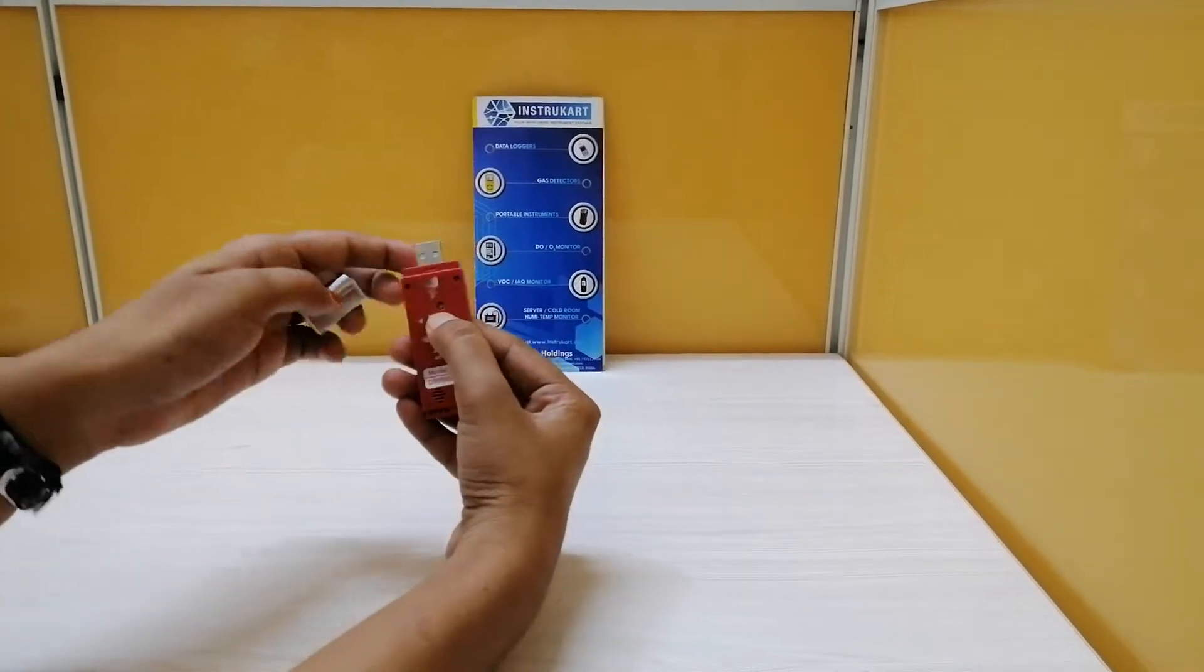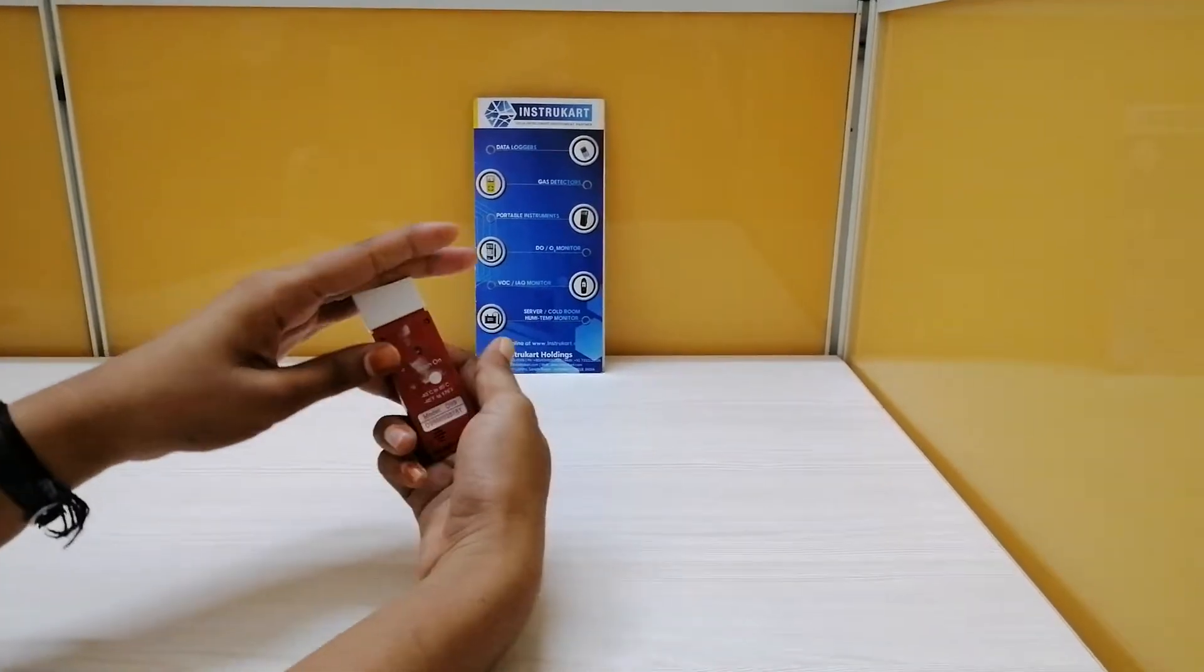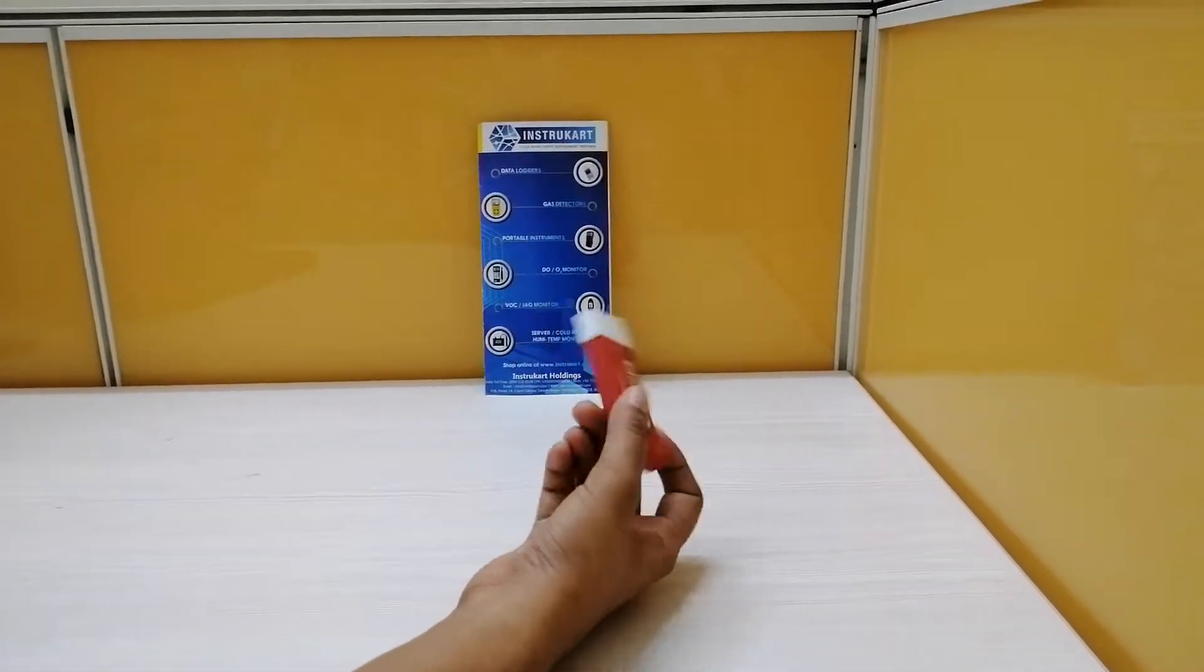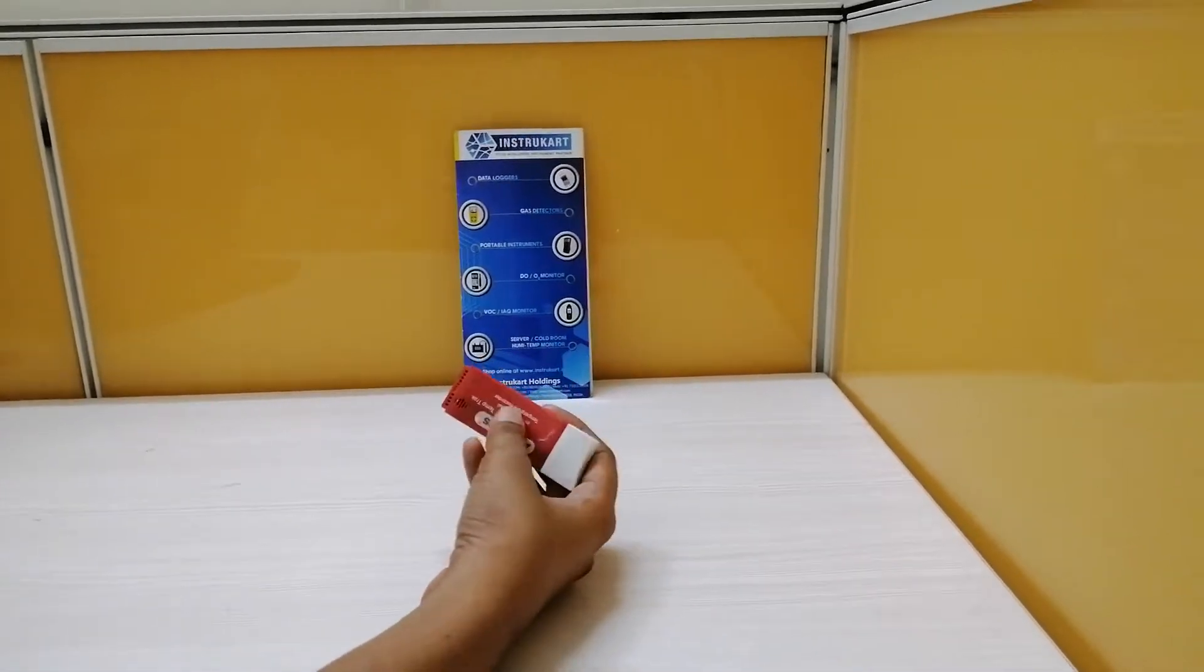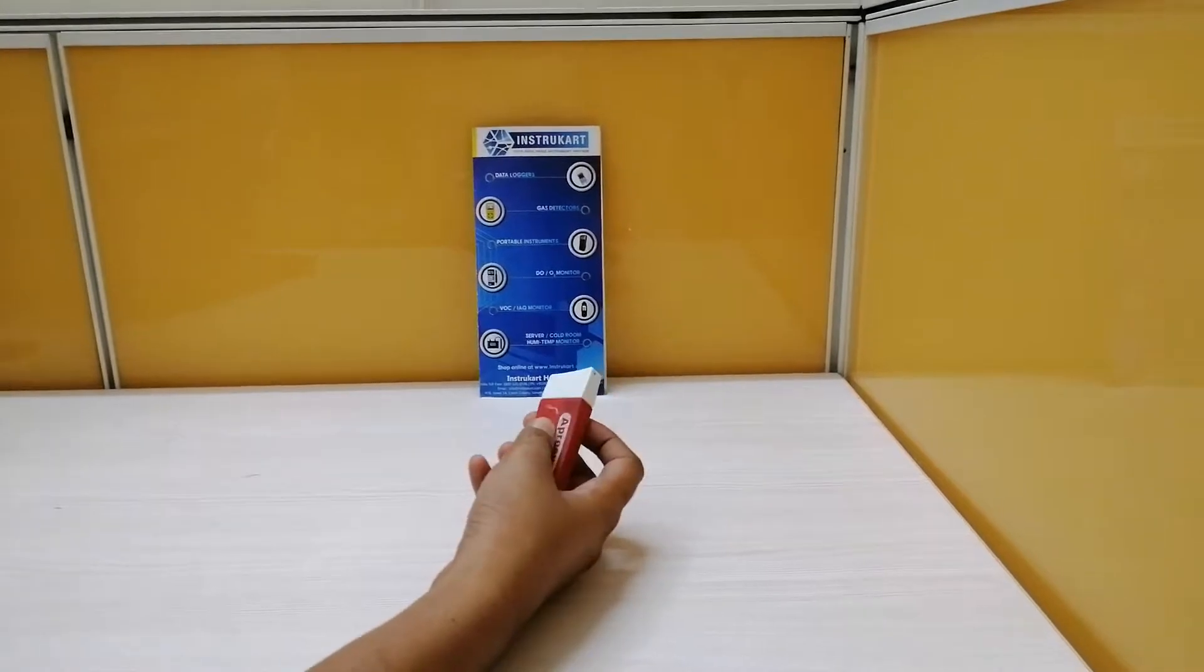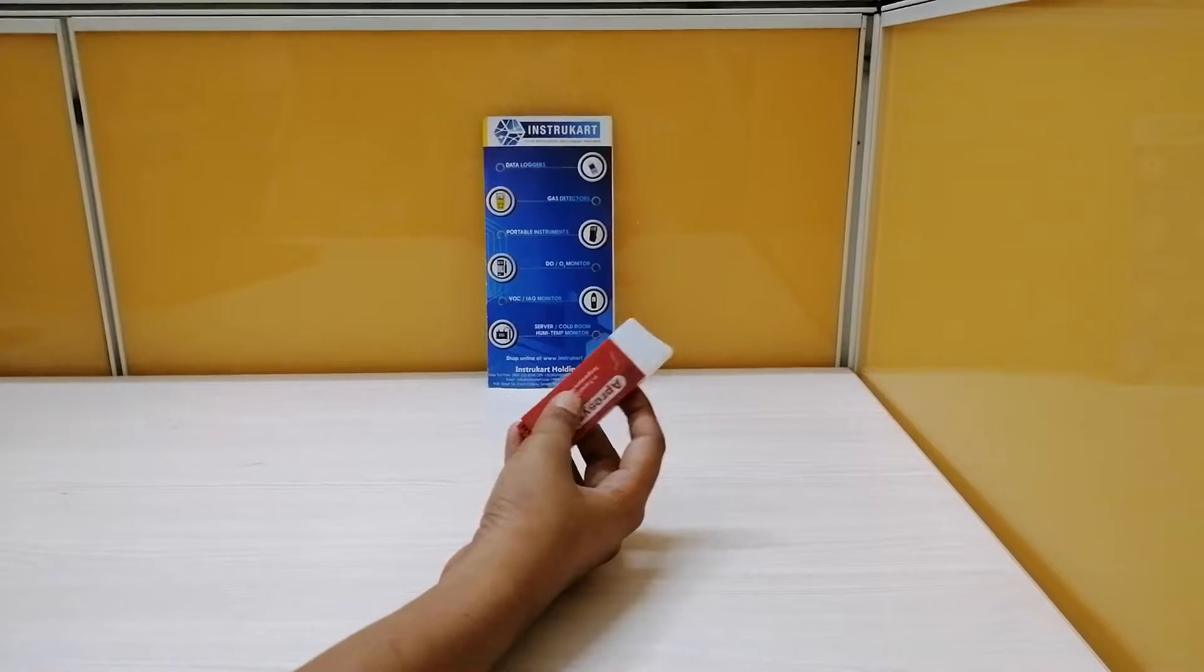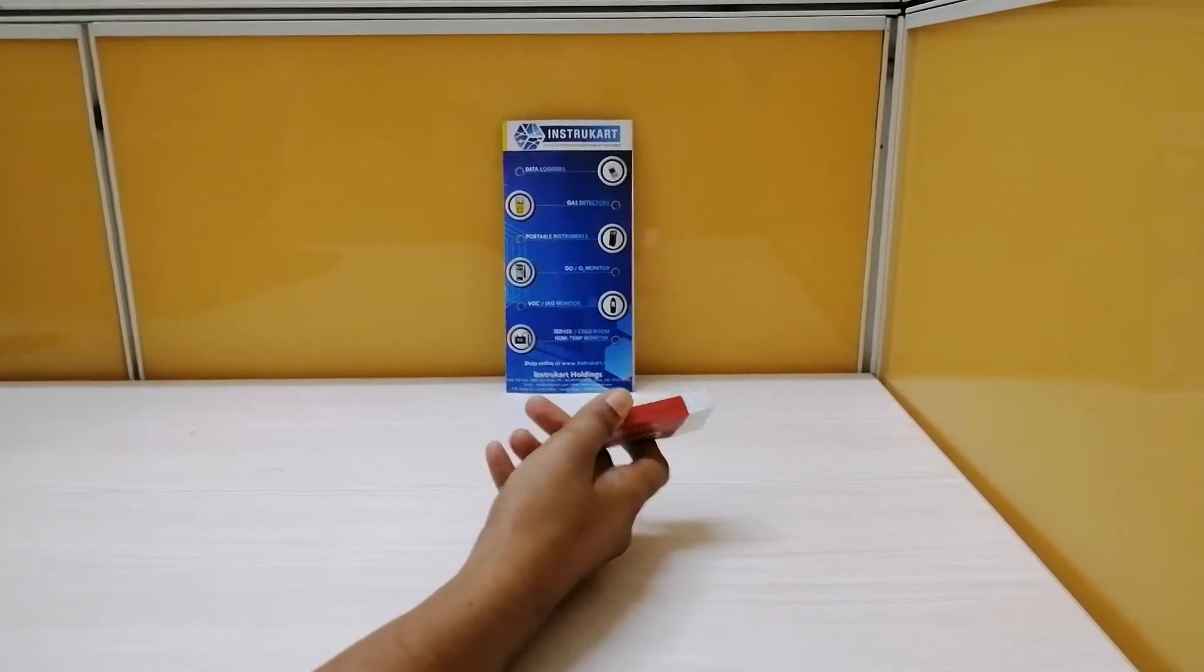This LED will start blinking, and then the device starts recording data. You can directly connect it to a computer for data reading, saving, and printing.